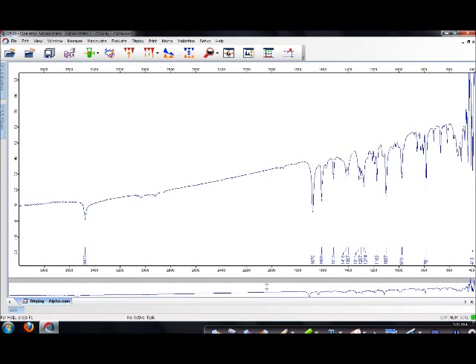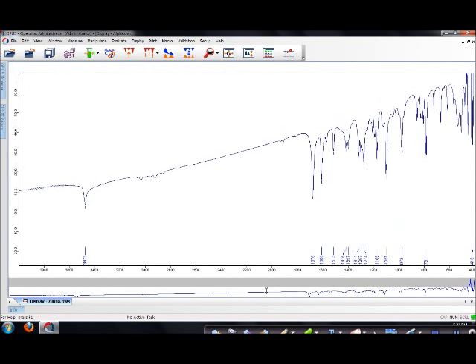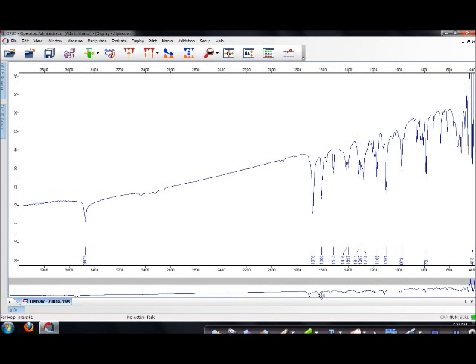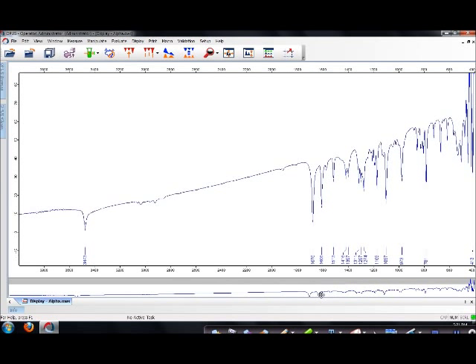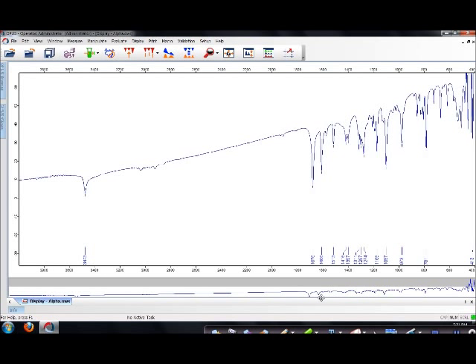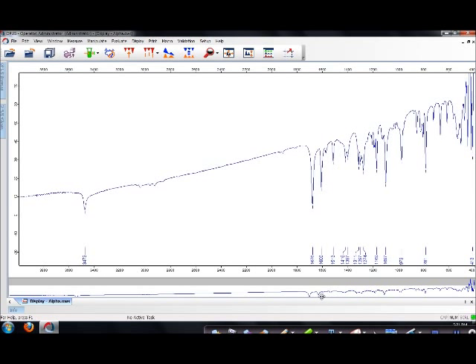You see, it's all good. So now you're just going to place the mouse cursor and drag down the bottom so that you have a clear projection of your whole screen. Adjust the view of the spectrum that you want to be printed on the paper that you're going to submit.